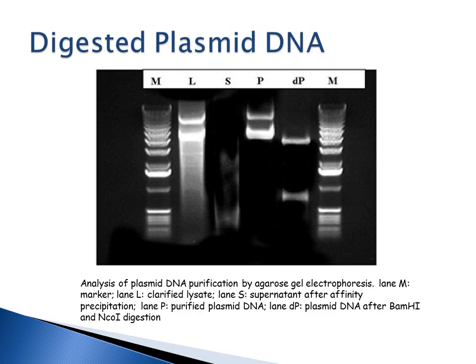If you took your crude lysate and just precipitated it to get some of your nucleic acid out, and you take that supernatant and run it, you're going to see again kind of a smeary, not quite as dirty looking. In the P lane, that's purified plasmid DNA, and you could see the two bands. You have a relaxed circle DNA, and you have your supercoiled DNA.